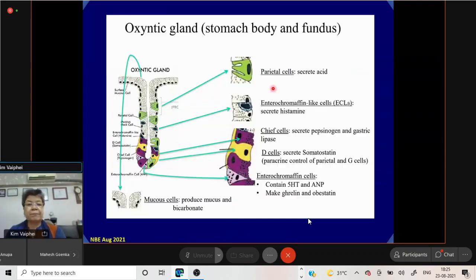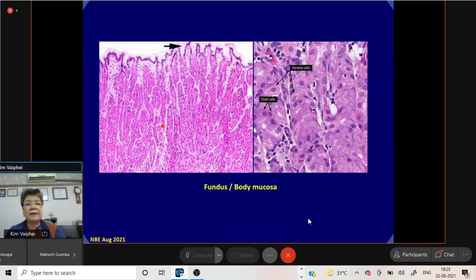Normally, gastric mucosa seldom has any inflammatory cells. This is another very characteristic feature to differentiate it from the remaining part of the intestine. Lamina propria contains a certain amount of inflammatory cells normally, but in the stomach, the lamina propria seldom contains any. Different textbooks will say some 1 or 2 or 3 or 4, but in my experience, especially as we have autopsy backup in our institute, normal mucosa does not have any inflammatory cell infiltration. It would have a little bit of mesenchymal component, and that's it. It doesn't have anything more than that.